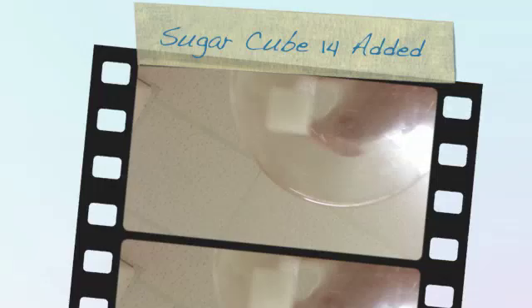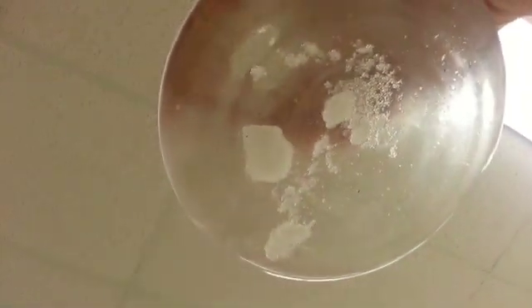You'll notice these ones are gone too. Can you still see it? So when I take the container off of the hot plate you'll notice it's probably going to cool down a little bit. Because there's no direct heat source anymore. But the system's already warm.